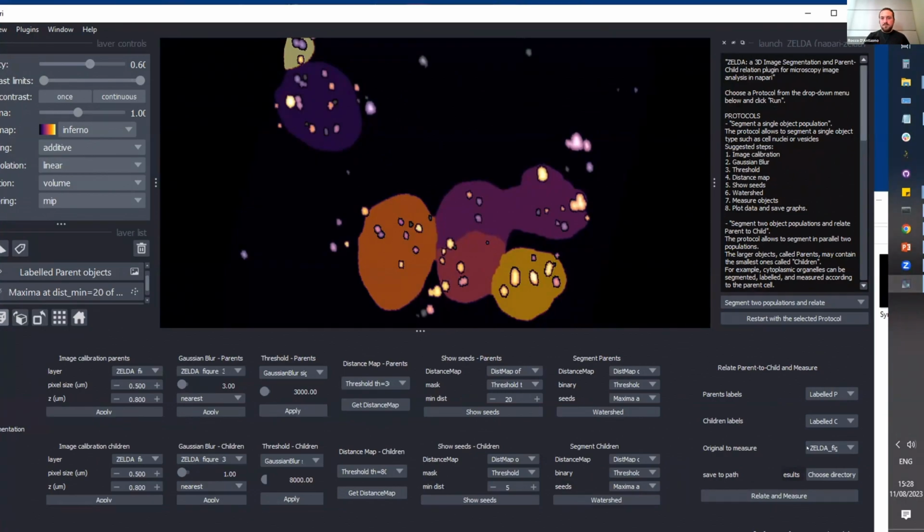You want to quantify in every RNA spot the mean fluorescence intensity, all the descriptors that we have seen before, but also you want for this RNA spot to identify which is the parent cell. So we have to select here the fluorescent image of the channel number 1, which is the RNA.